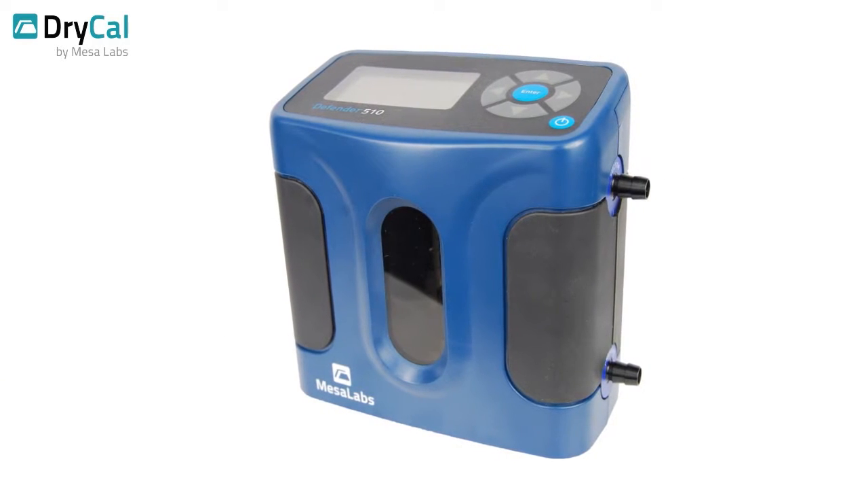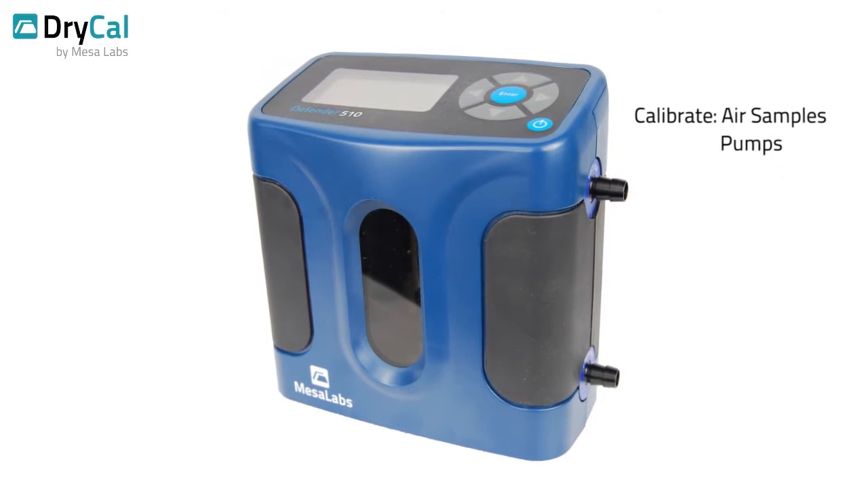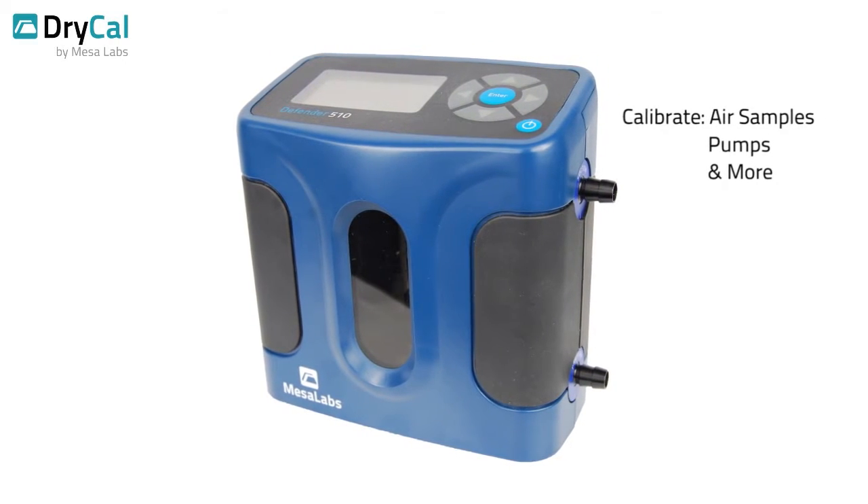The Defender is a volumetric primary standard from Mesa Labs, the global leader in gas flow calibration. The Defender is the first choice of professionals for calibrating air samplers, pumps, and other devices measuring volumetric gas flow.